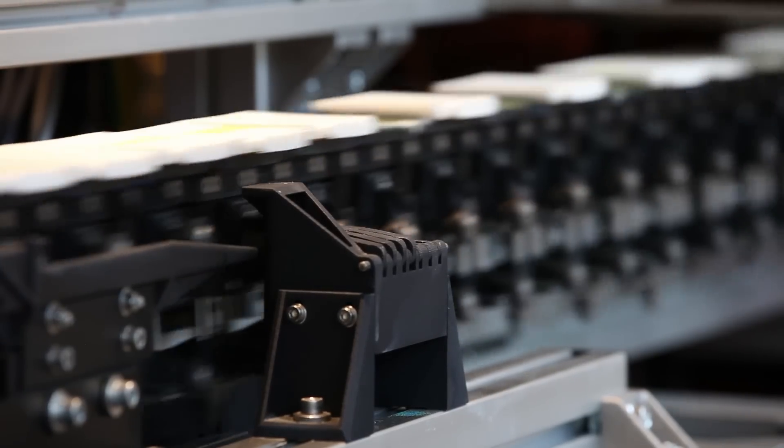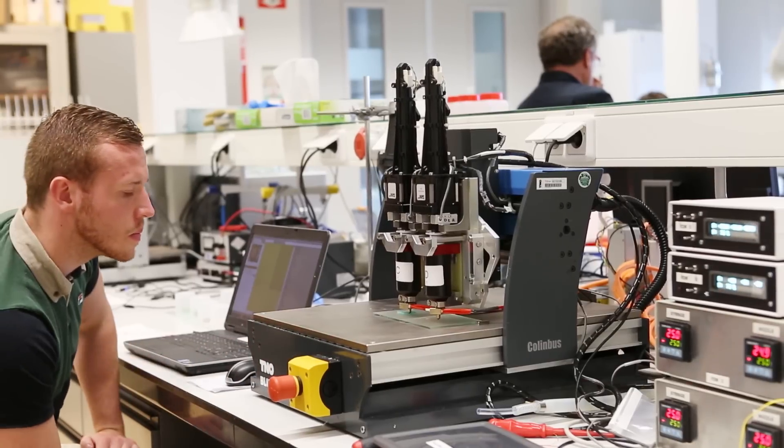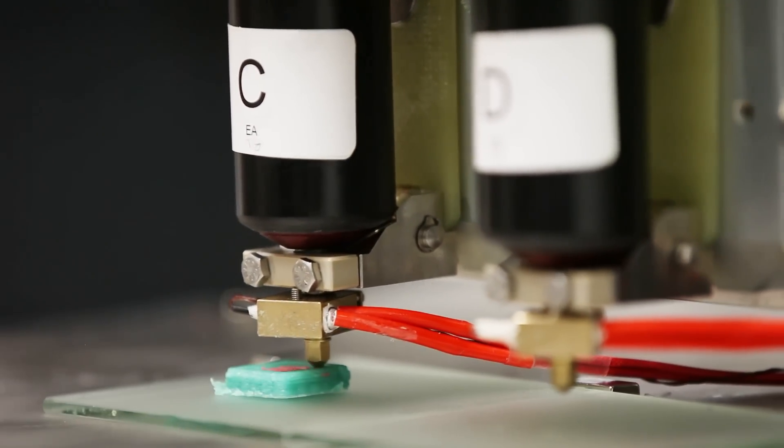So you not only get the technical advantages of 3D printing, but also the advantages of on-site cost-effective production.